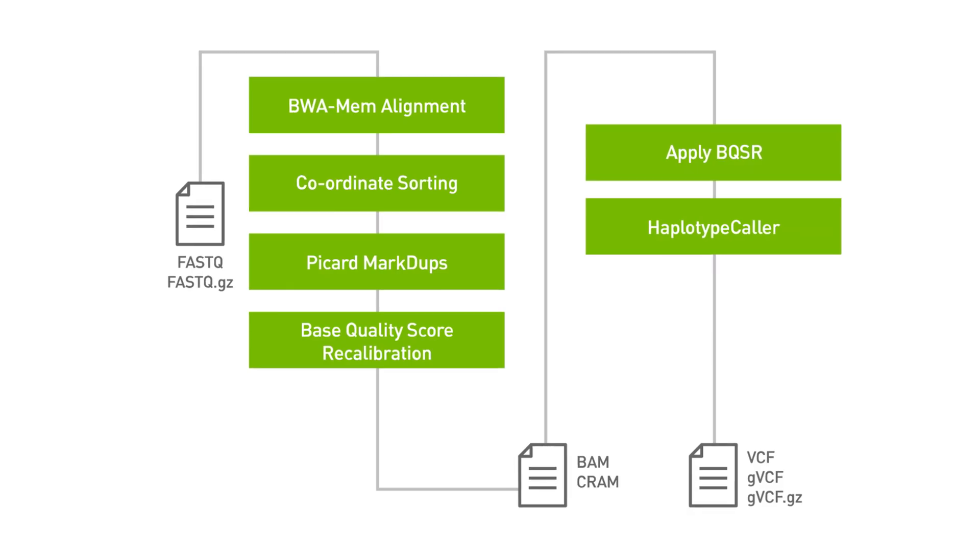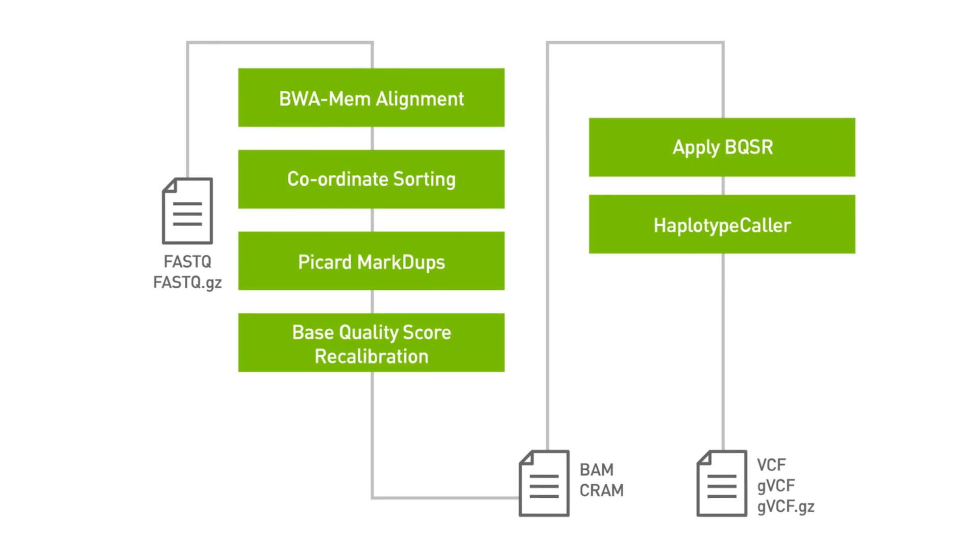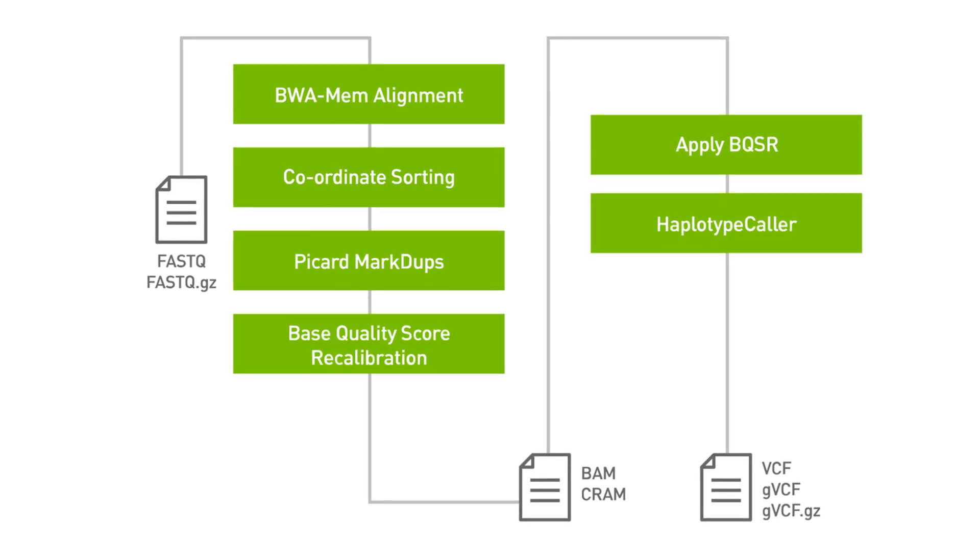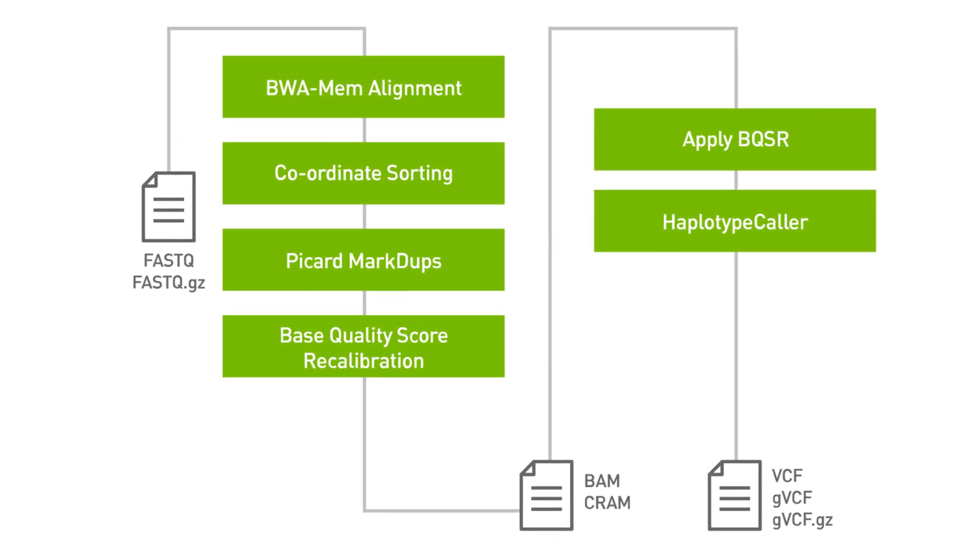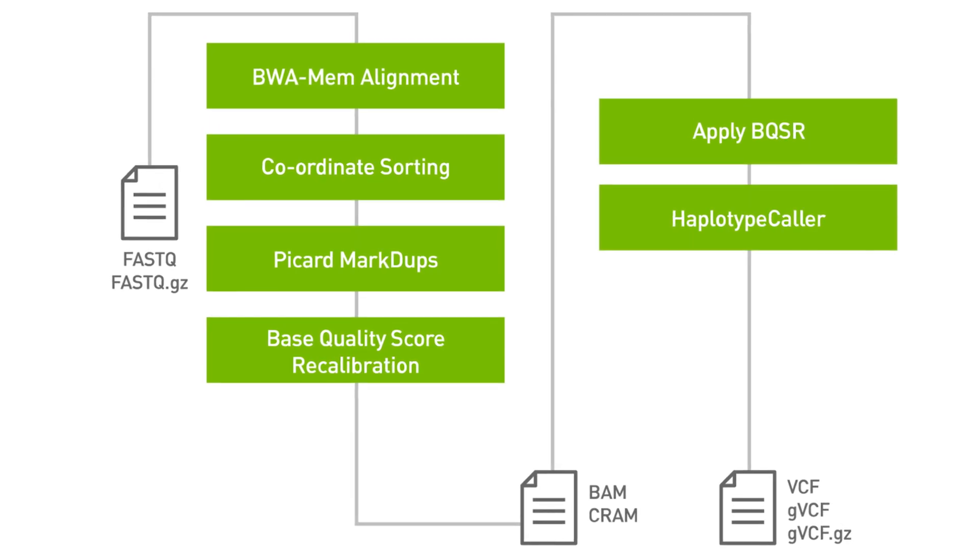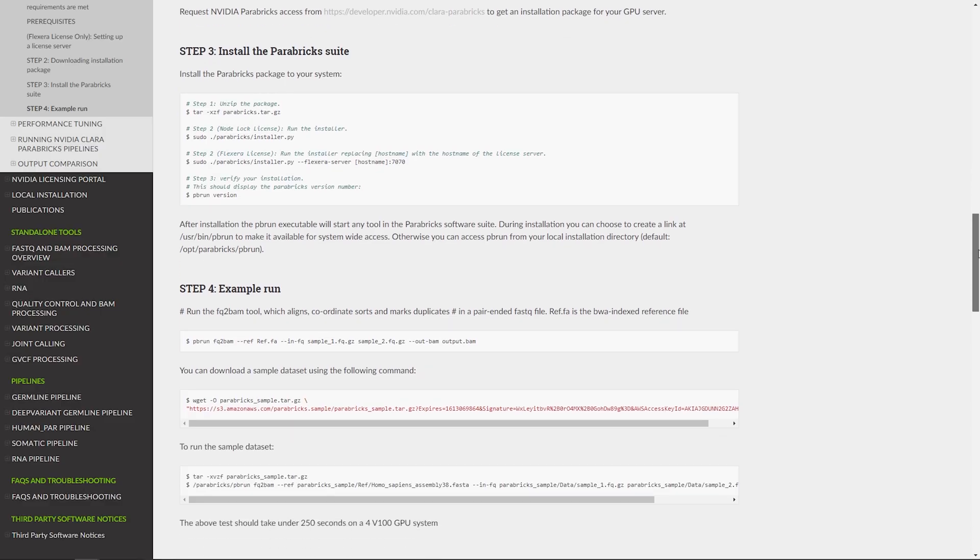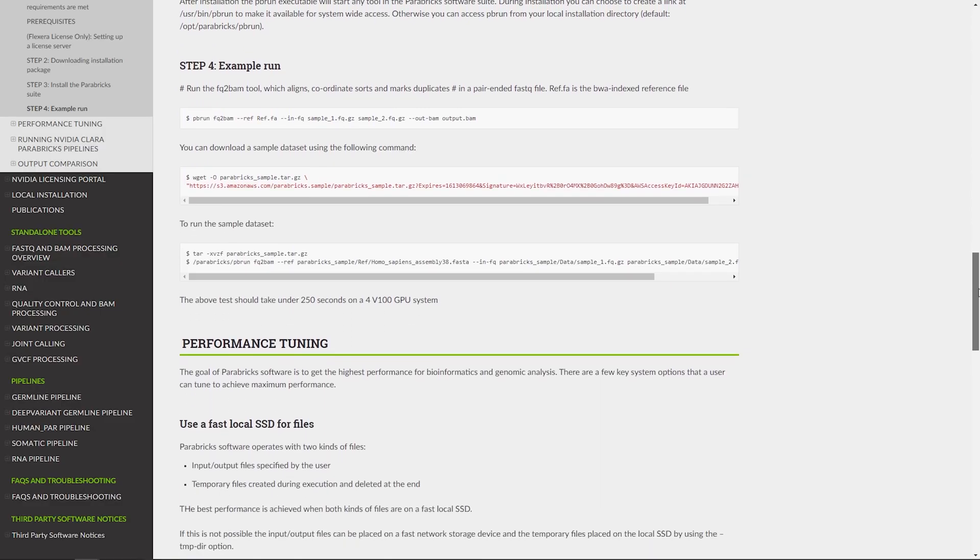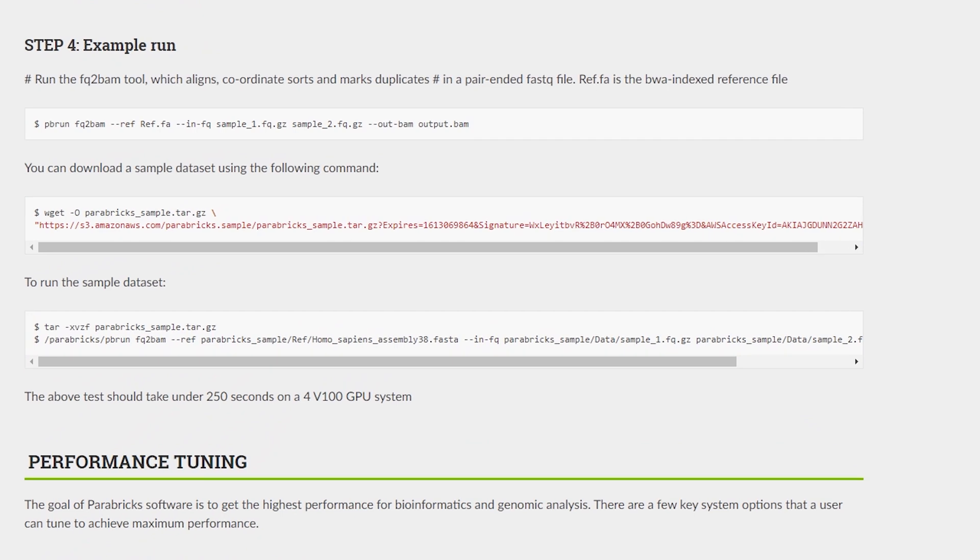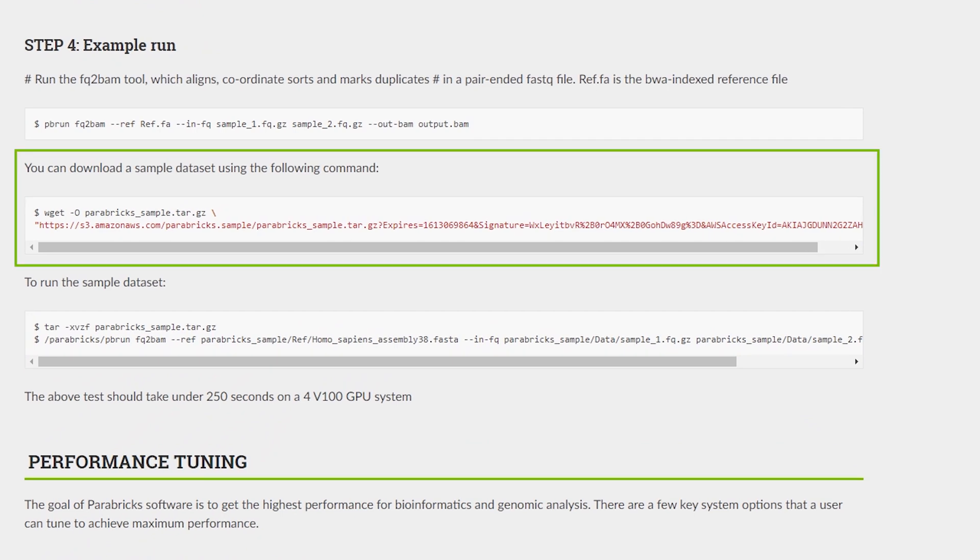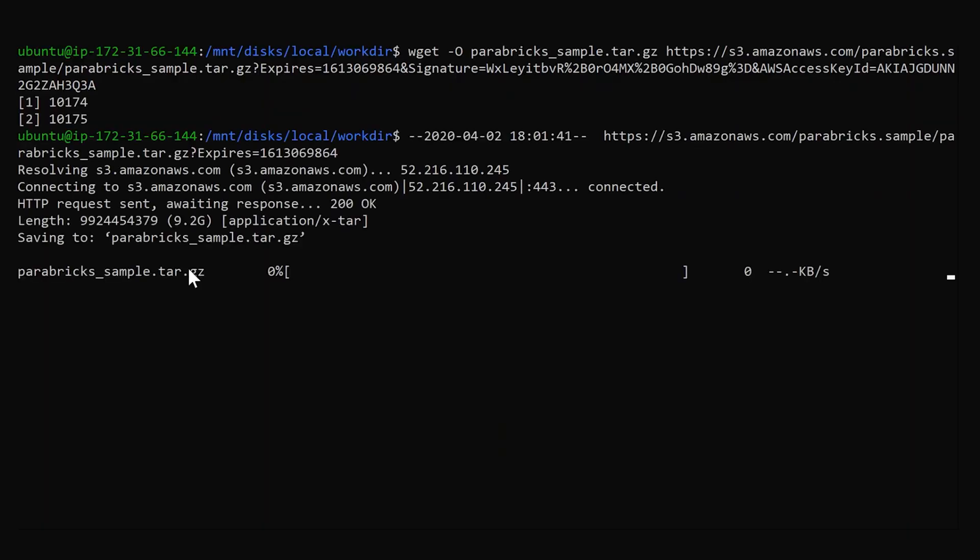Let's continue with an example of aligning, sorting, and marking duplicates for a sample pair of FastQ files. There's a sample dataset you can download and test your installation against to make sure everything is running smoothly. To download the sample dataset, navigate to the instructions provided in Step 4 of the Quick Start Guide.